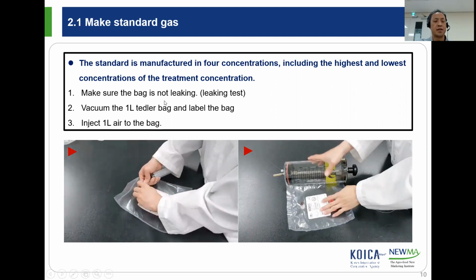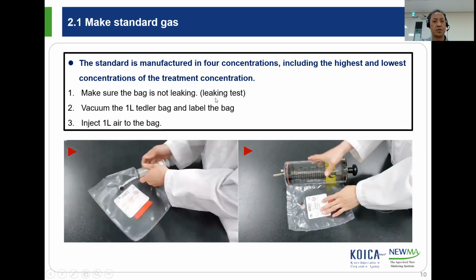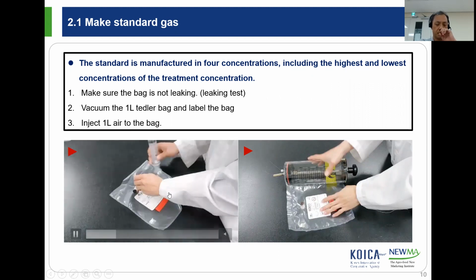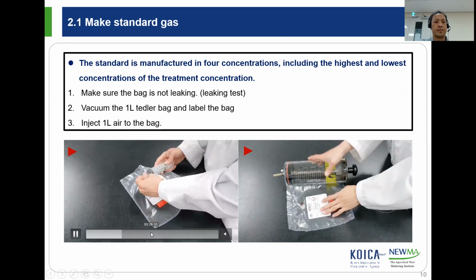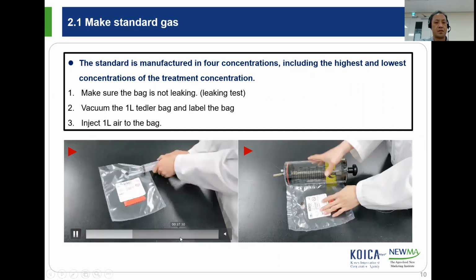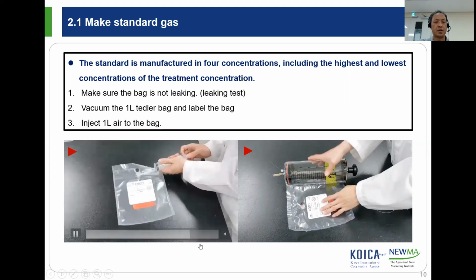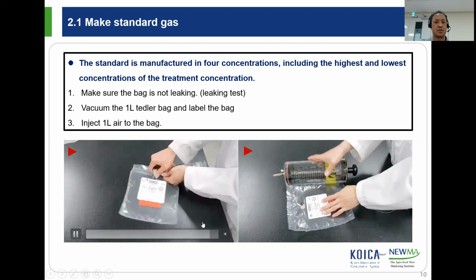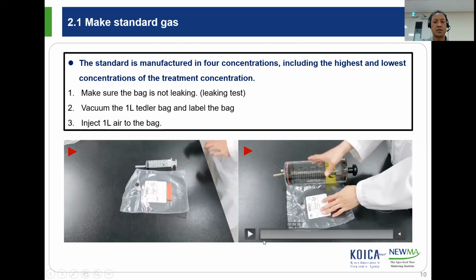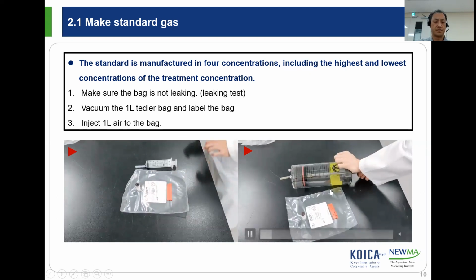Make sure the bag is not leaking. We should do a leaking test like this. And then vacuum the 1 liter Tedlar bag and label the bag. Okay, and then inject 1 liter of air into the bag.